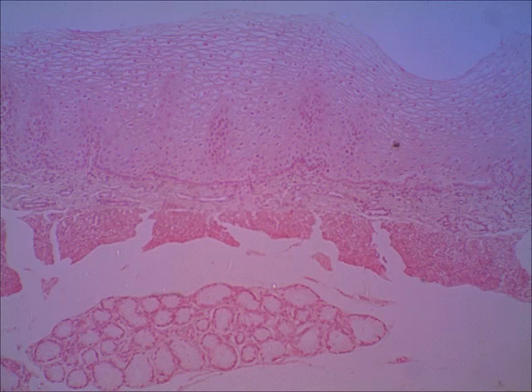All right, now here again, you see your mucosa. Now you're seeing a higher power. And here you really get the idea that it's the non-keratinized stratified squamous epithelium. You can tell it's non-keratinized because the cells at the top still have a nucleus.